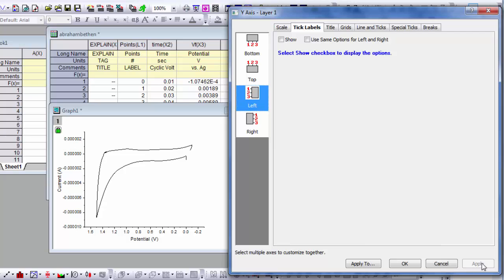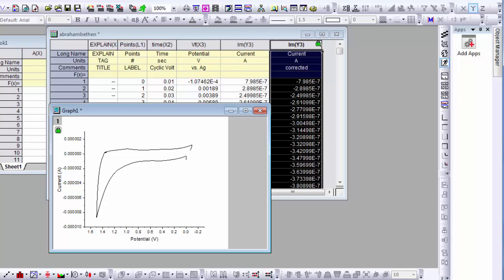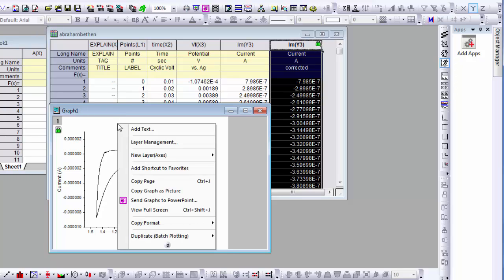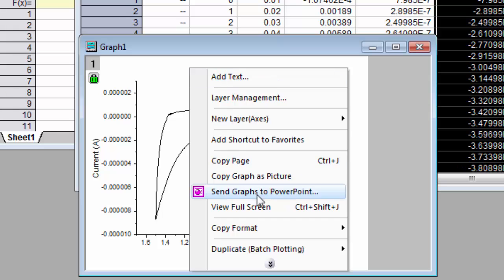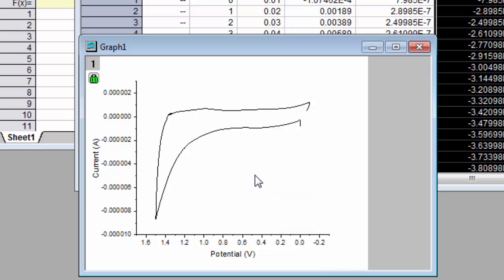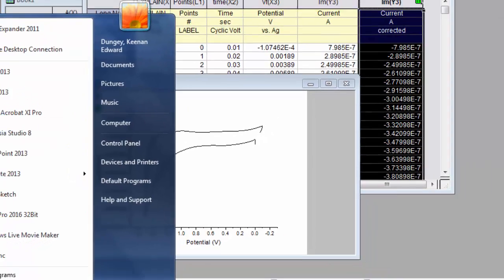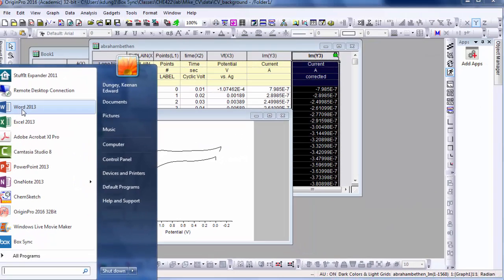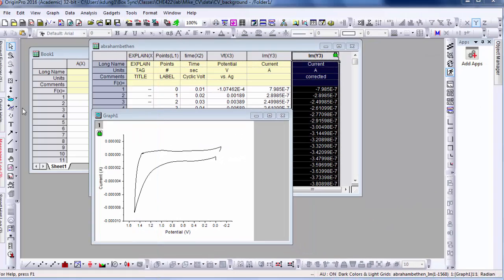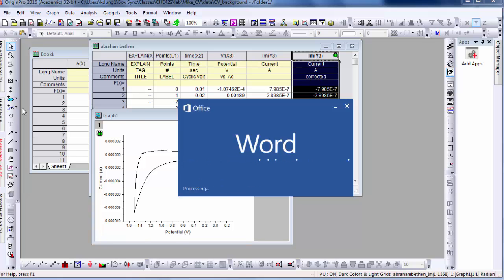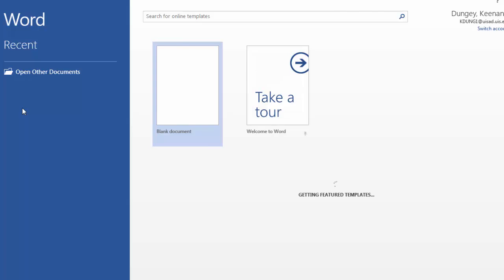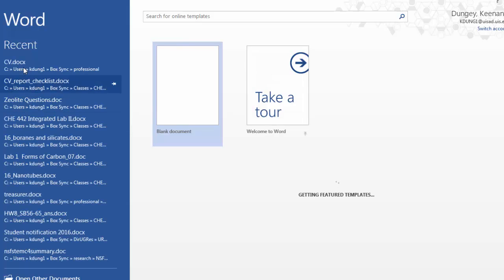So now we have a properly formatted graph. We can save our work so far. And we can export this graph, copy it as a picture and put it into our lab report. So that's just the background scan.